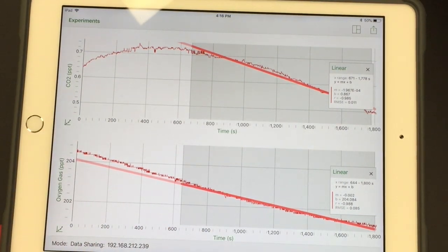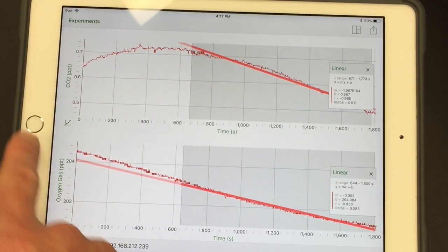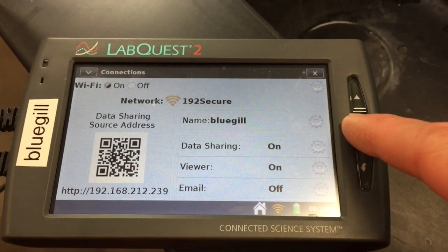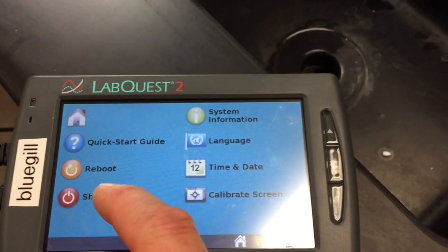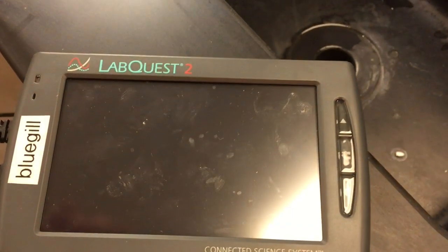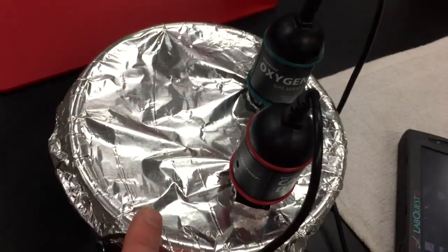You can take screenshots of the graphs and include them in your write-up. When the lab is over, on your LabQuest device click the home button, select system, and shut down — that's how you properly power these devices down. Then go ahead and plug it in. With the spinach leaves, return those to the designated place in the room. Also save the aluminum foil and try not to destroy it.